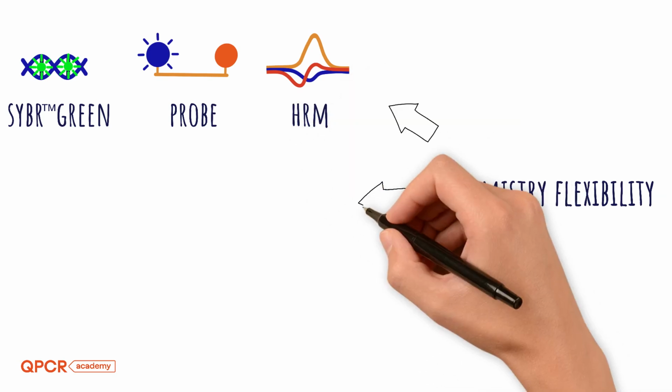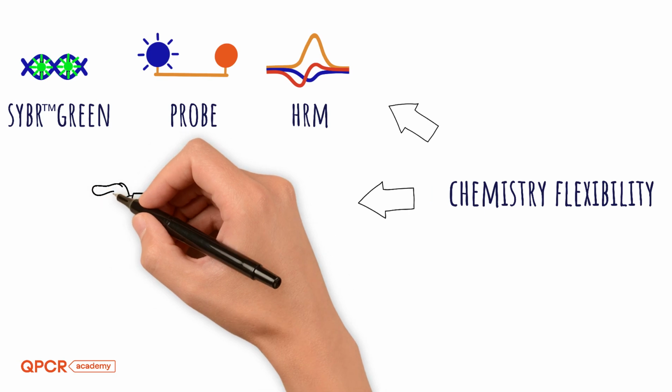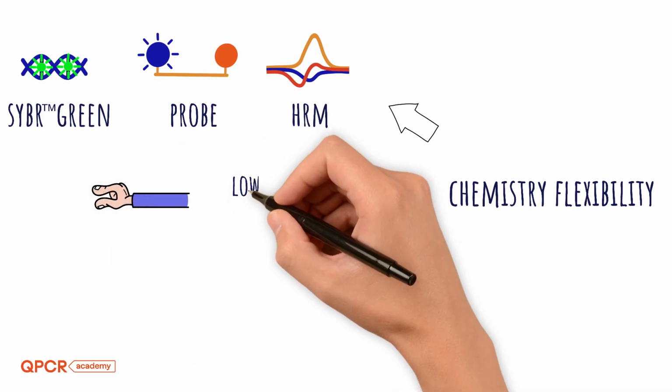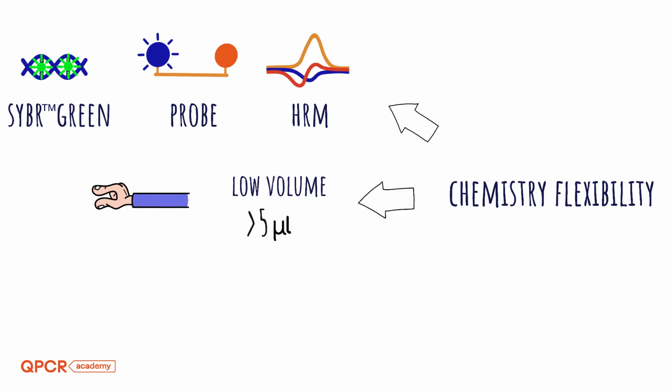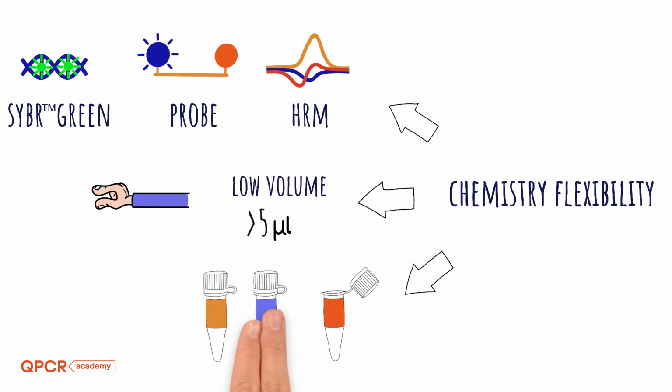Working with limited samples or expensive reagents? Check whether the system allows low reaction volumes, sometimes down to just 5 microliters. This can save money and improve sensitivity. And ideally, look for open platform compatibility, so you're not locked into one vendor's plastics or reagents. That flexibility saves money in the long run.